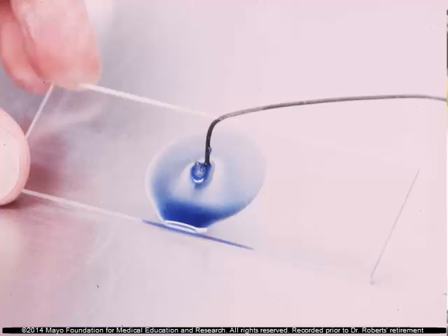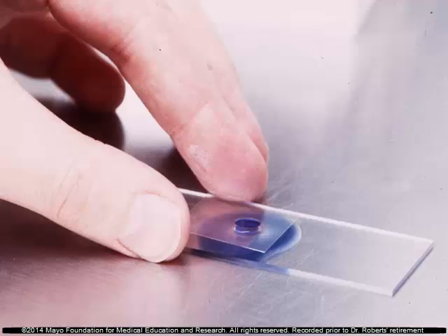If you do that, when you put the cover slip on, if it's too large, it will fly out from underneath the cover slip onto the top of the bench where you're working, and that's not what you want it to do. So you have to take a smaller piece. Here you can see the cover slip going on, and it will be flattened out unless it's too large, and you'll be able to see the culture as it's been growing.